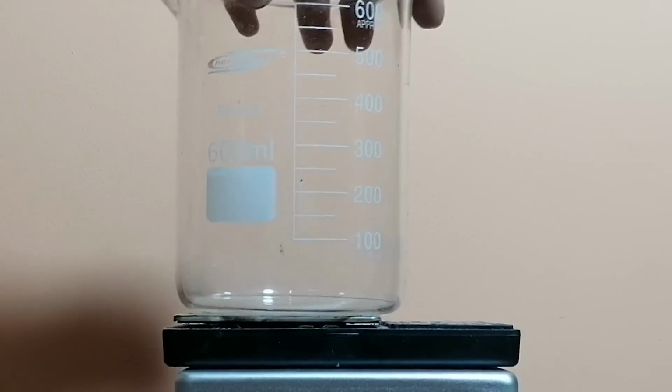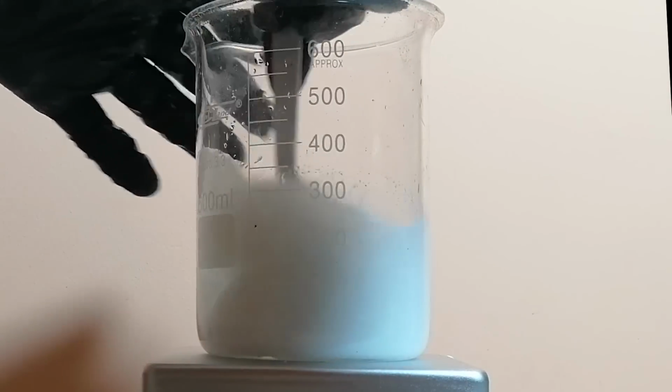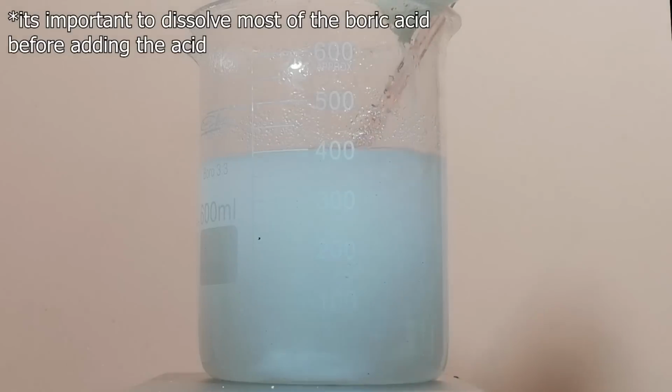Video coming soon. So to start out, I've weighed out around 100 grams of borax. Next I've added some water, and I've cranked up the heat. Then I've added around 37 ml of concentrated hydrochloric acid.